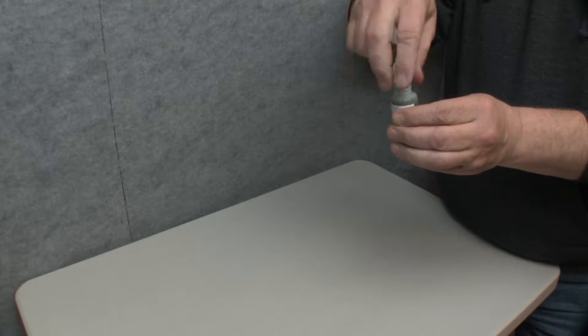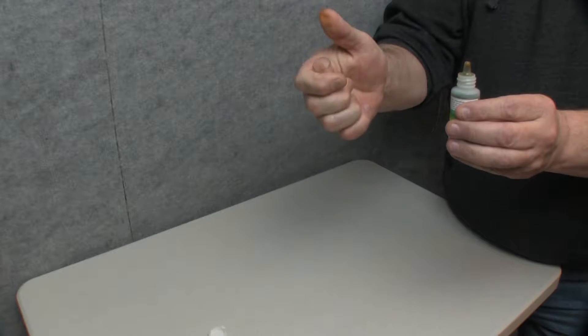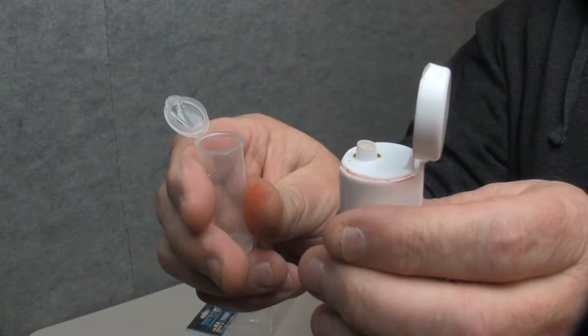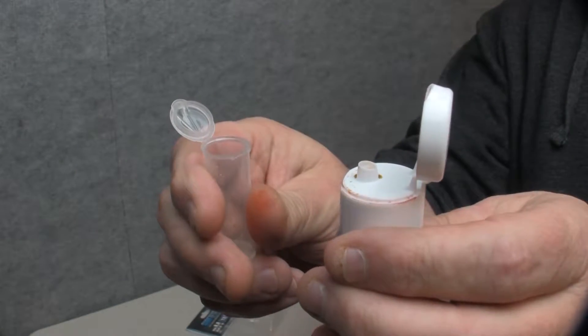Fumbling with the twist caps of other tests can be frustrating as caps are often misplaced and lost. The snap caps on both the test vial and the reagent bottle will allow you to quickly determine pH without having to set either bottle down.